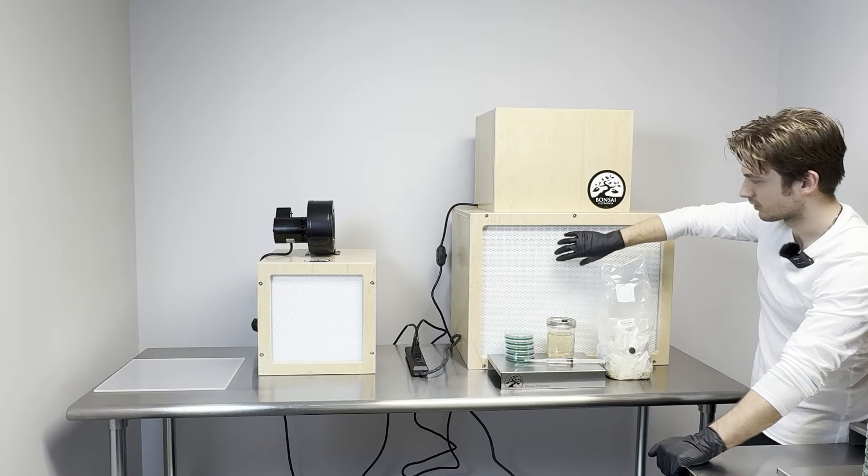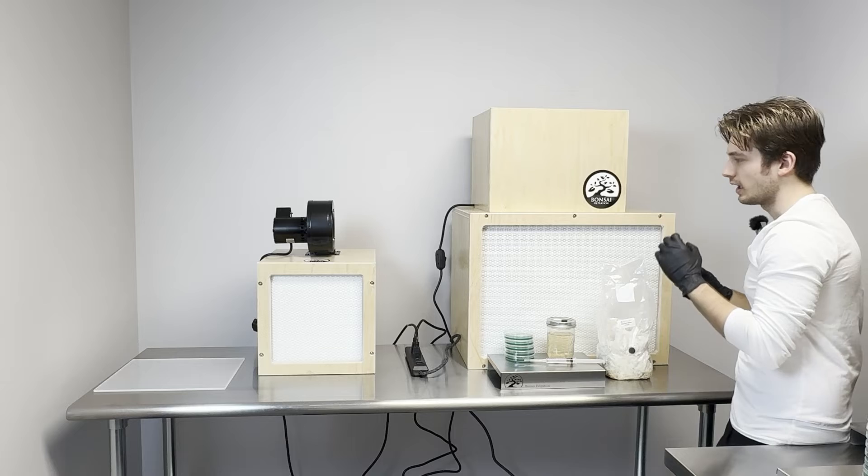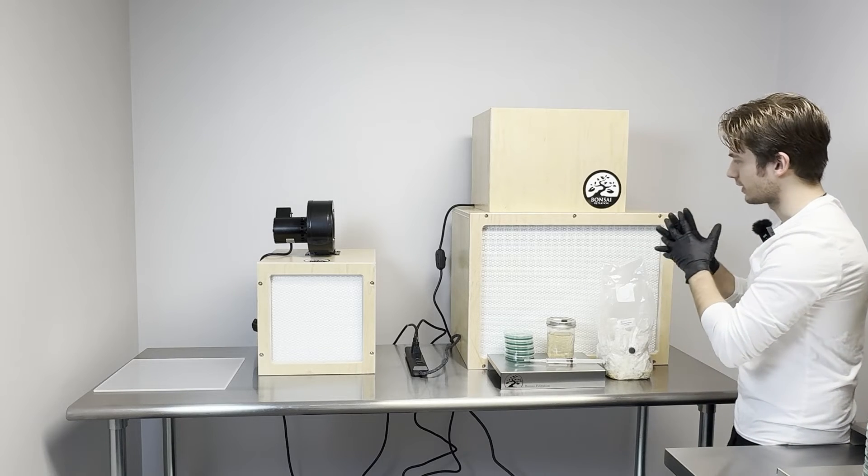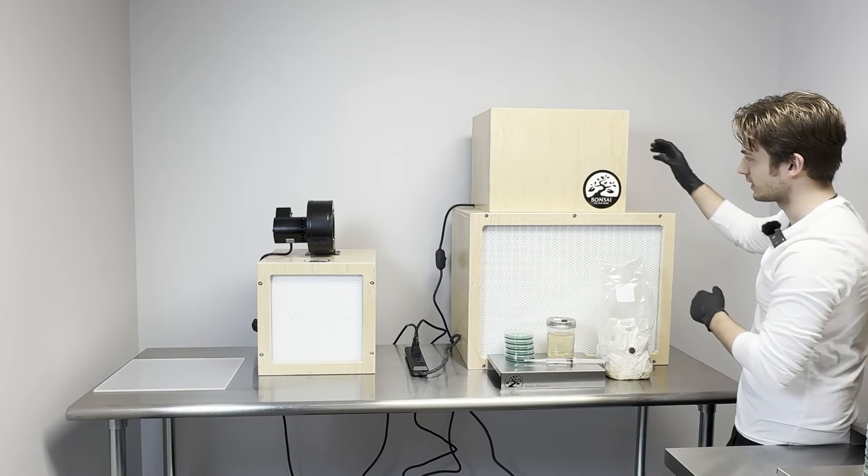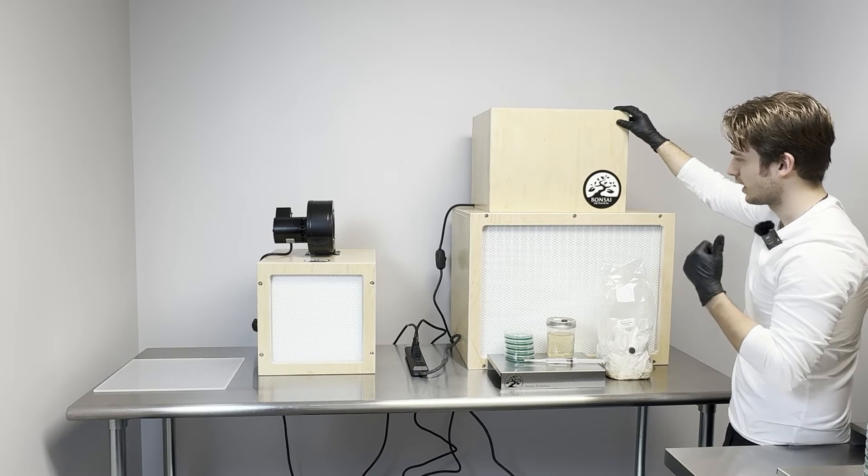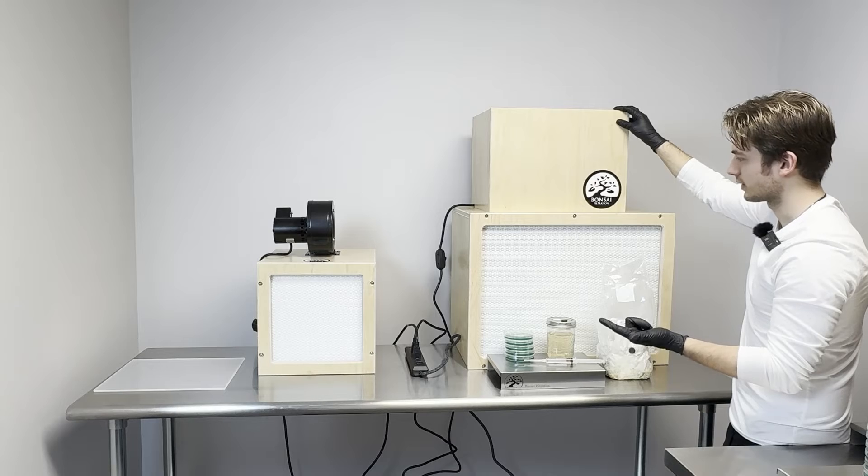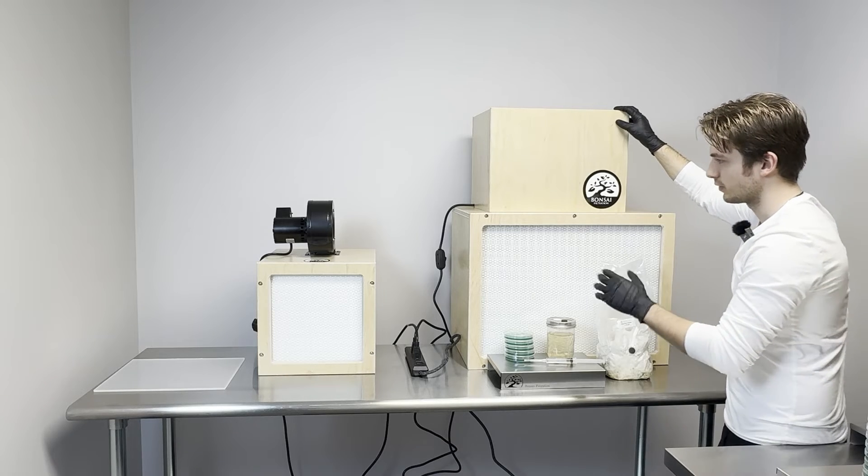Both feature the same motor that is manufactured by a private label company that produces and manufactures these high-end motors for Wolf and Sub-Zero appliances. But the major distinction between the two motors other than the power difference is the Bonsai XL features a pre-filter.